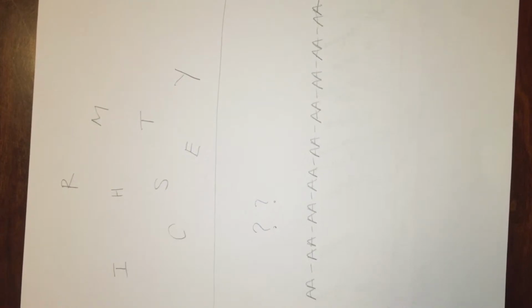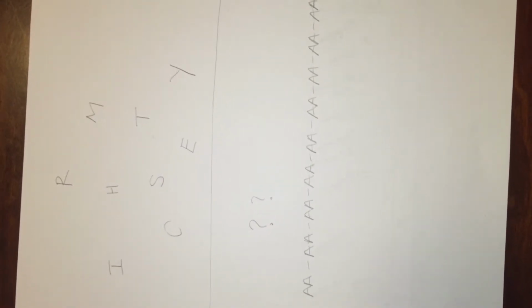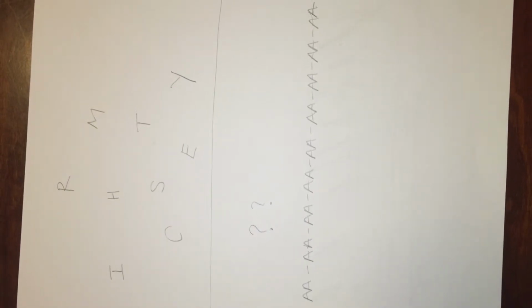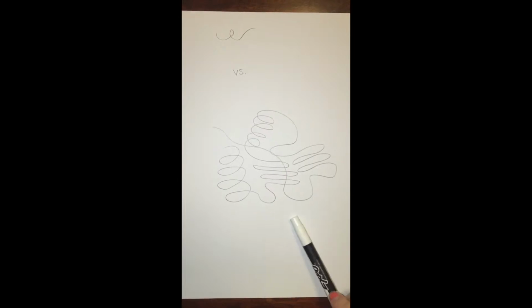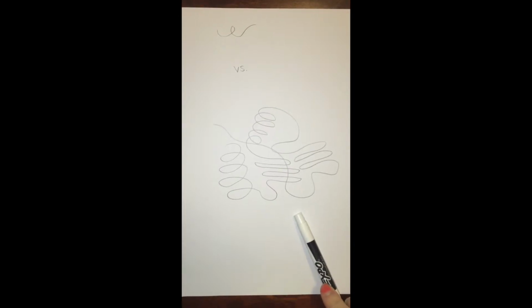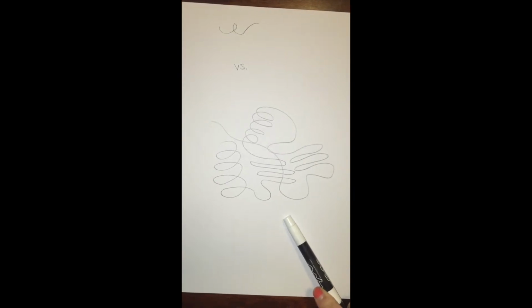Now that we know the amino acid composition of our protein, we need to determine the order in which the individual amino acids are linked. Because we have a small protein, we can use the Edman degradation procedure to determine our amino acid sequence. To note, if we were dealing with a larger protein, approximately 50 residues or more, then we would need to break the peptide up into smaller sequences using enzyme hydrolysis.